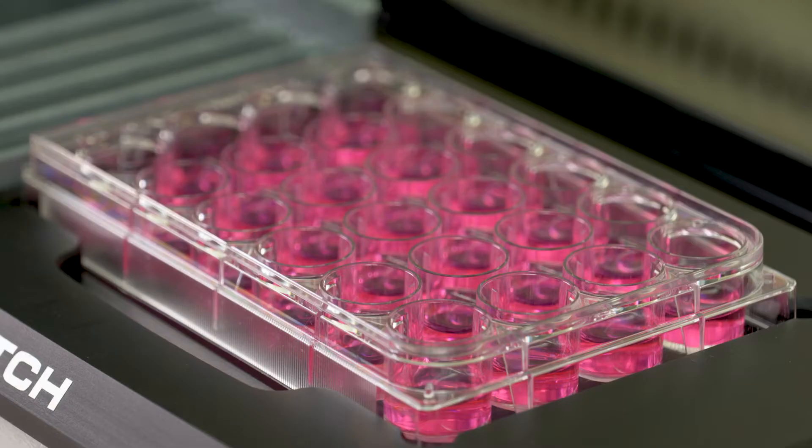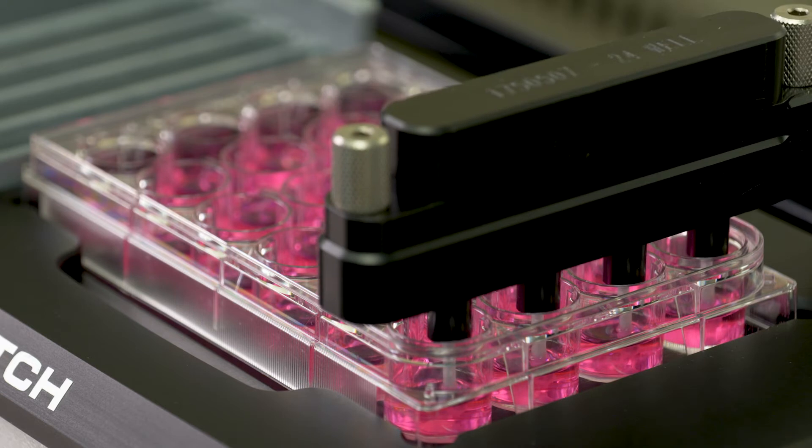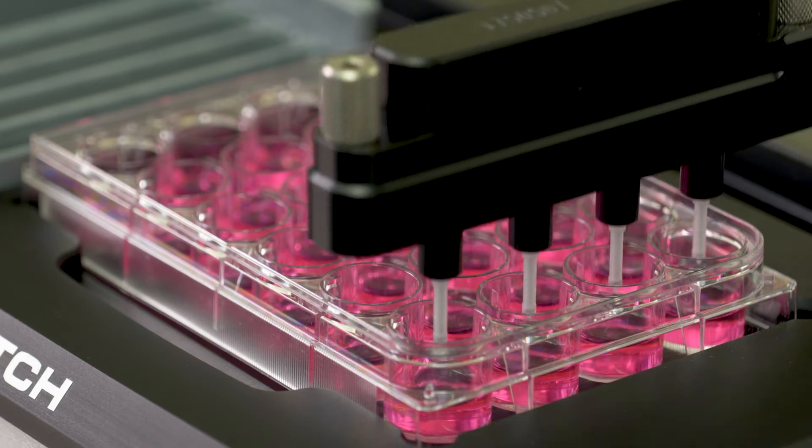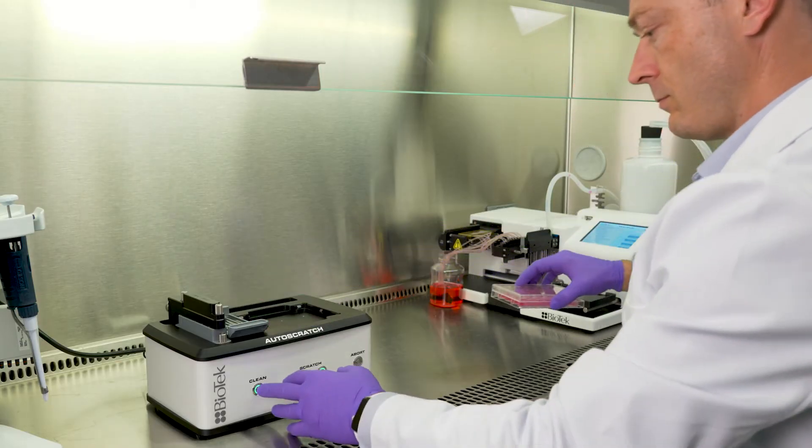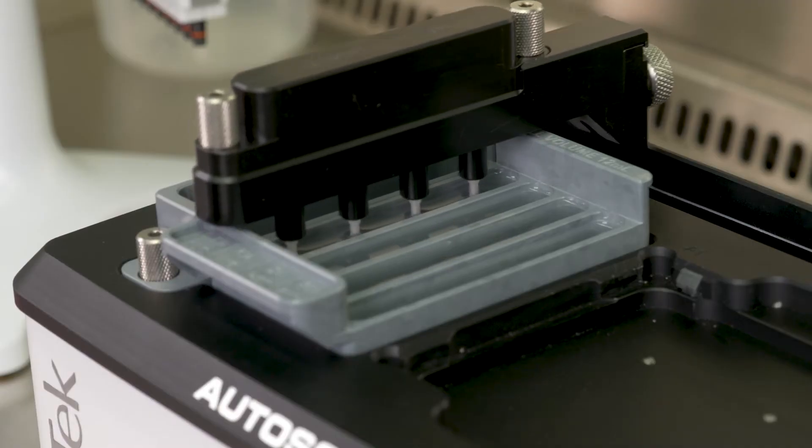With the push of a button, the auto scratch creates consistent wounds in 24 and 96 well plates. The compact system features an automated cleaning routine to keep the scratch pins free of buildup and avoid contamination.